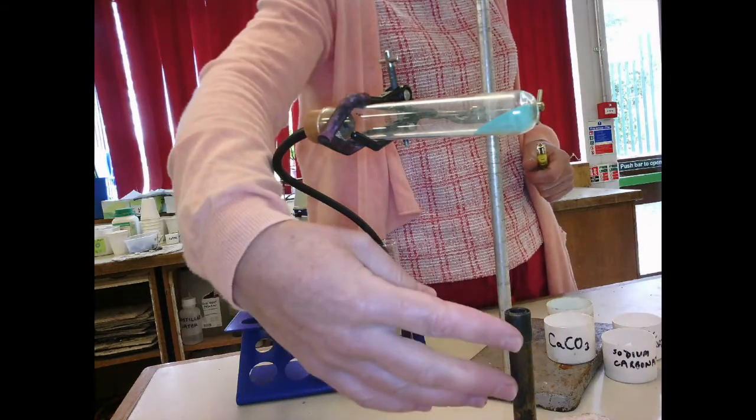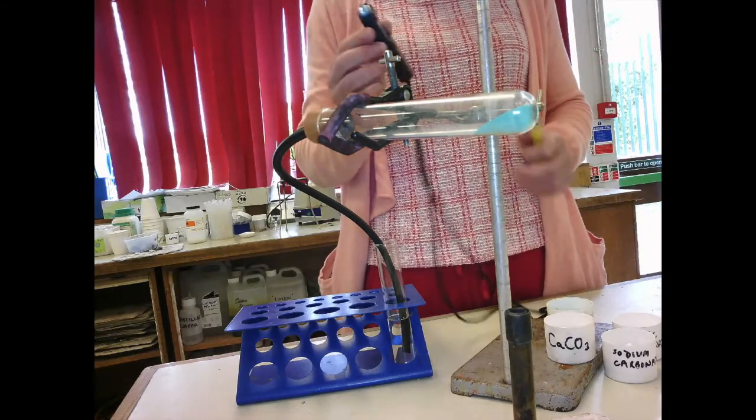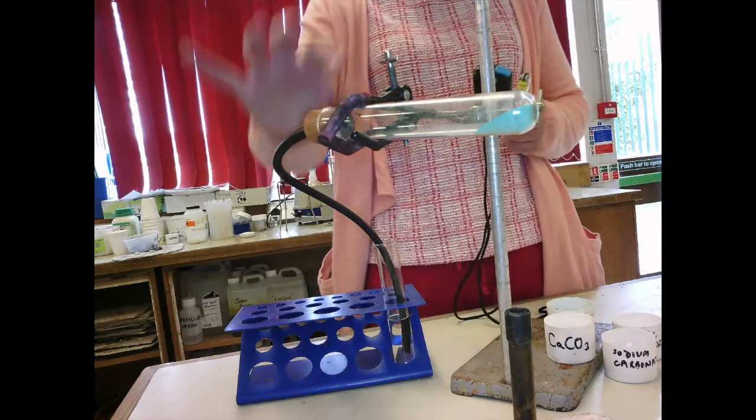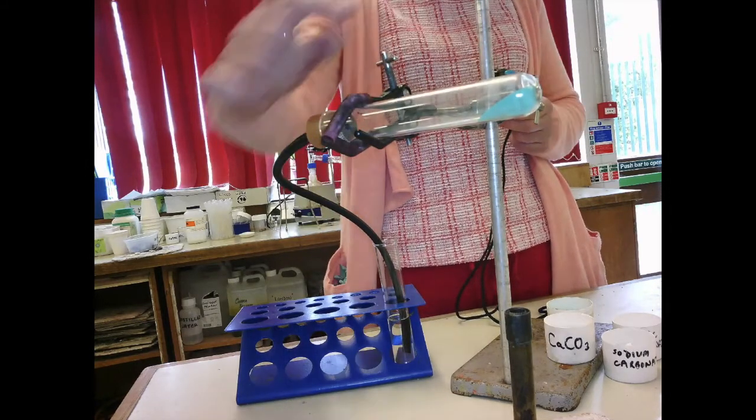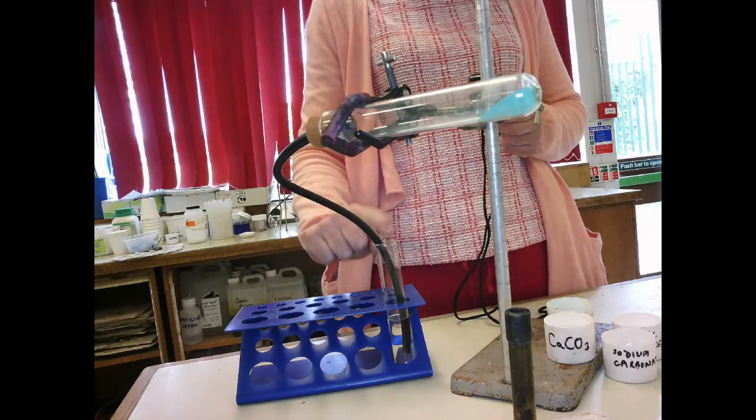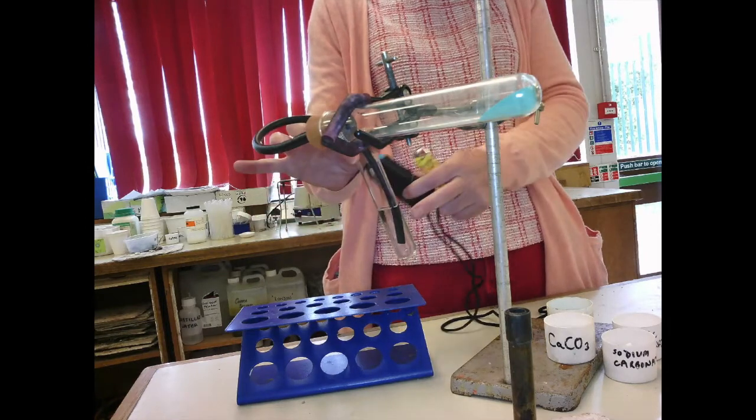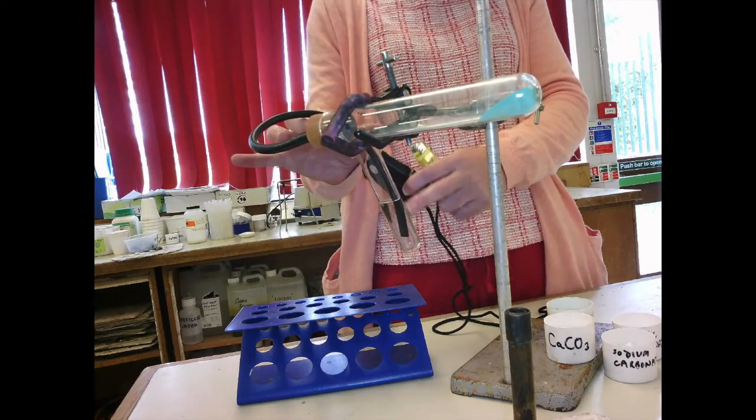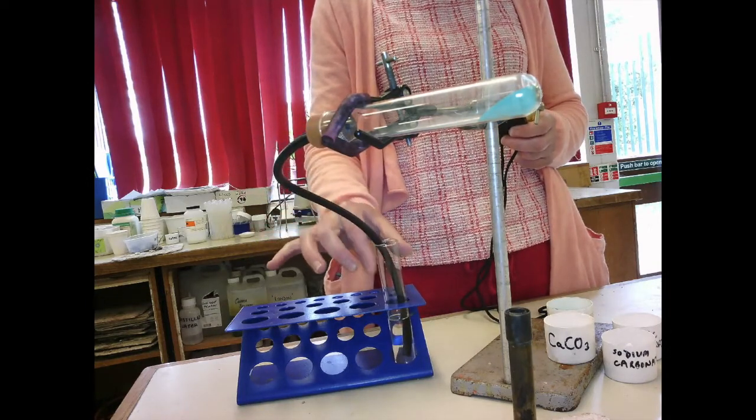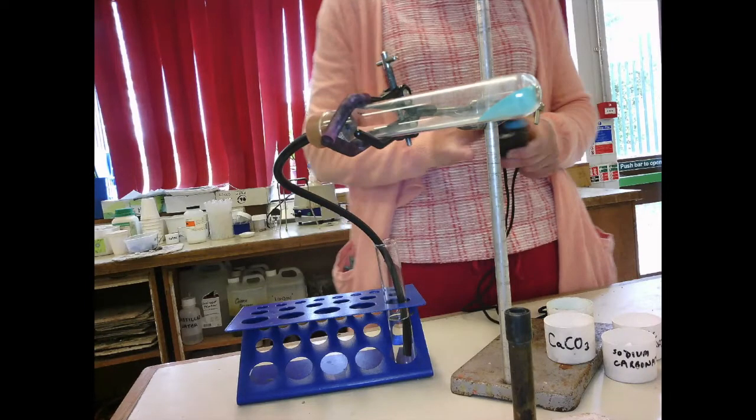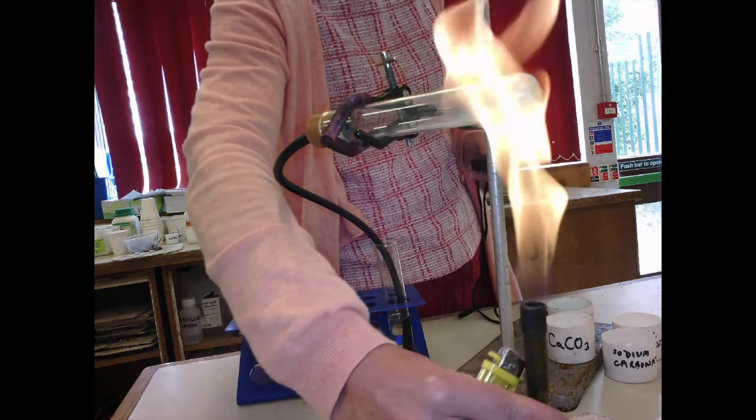I'm going to heat up the copper carbonate with the Bunsen, and I'm going to time how long it takes for this copper carbonate to decompose. Now when it decomposes, copper carbonate will make carbon dioxide gas. Carbon dioxide gas will bubble into this lime water, and I time the time taken for this lime water to start changing milky.